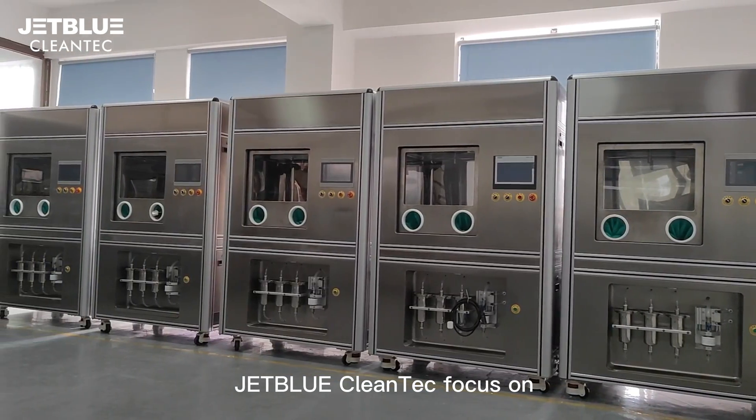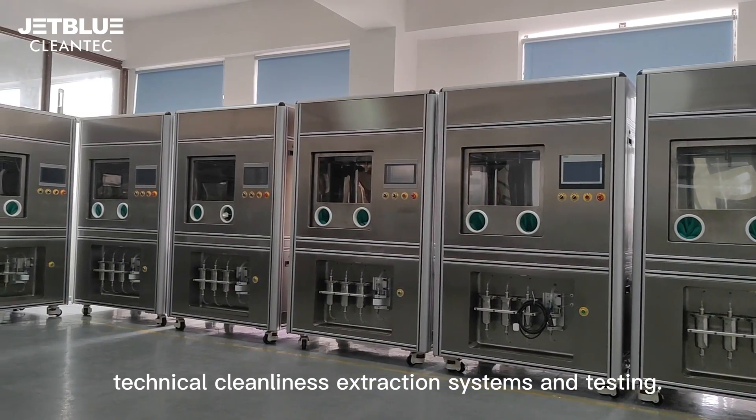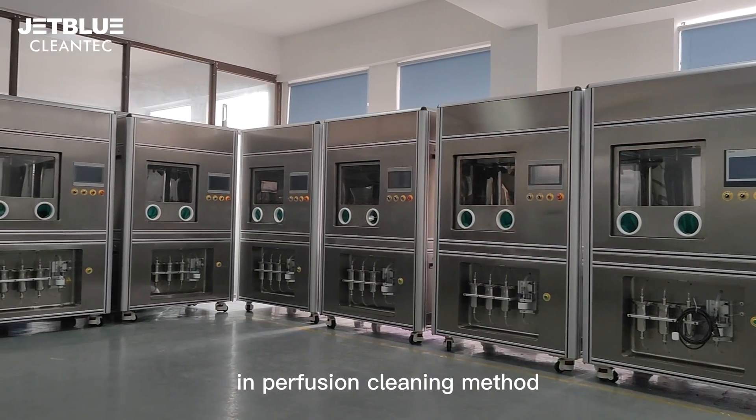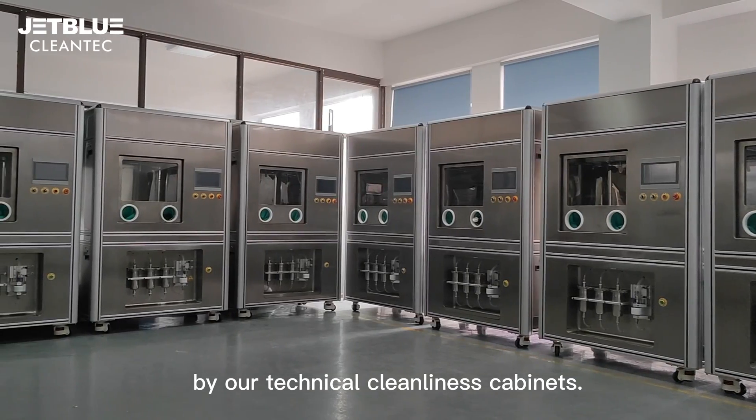JETBLUE CleanTec focuses on technical cleanliness extraction systems and testing. Let us see how to prepare samples using the perfusion cleaning method with our technical cleanliness cabinets.